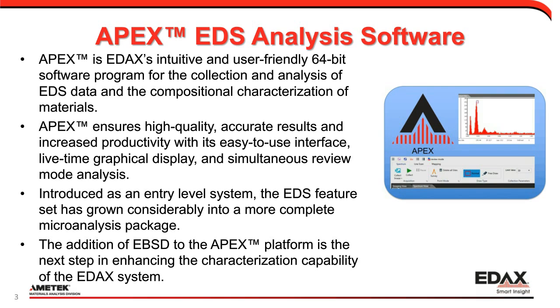With APEX, it started as an entry-level system, and the feature set has grown on the EDS side into a complete microanalysis package. And then, like I mentioned, by adding EBSD, we're taking the next step in adding structural characterization to complement the chemical characterization capability.